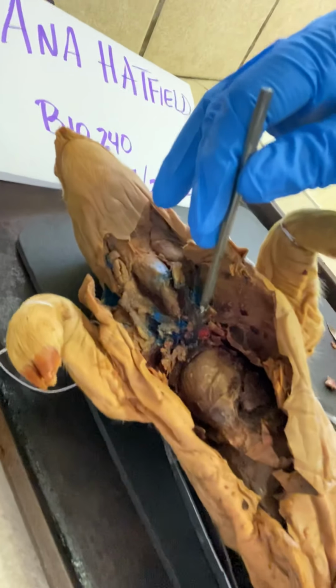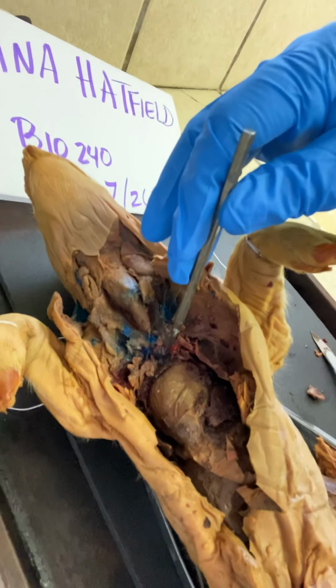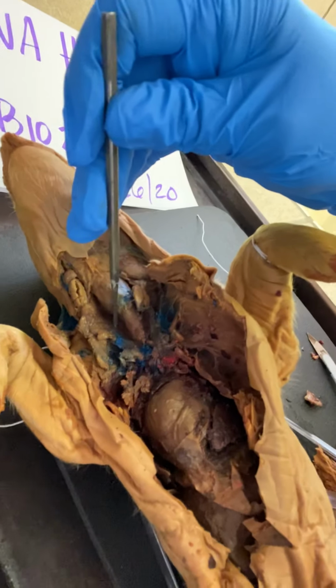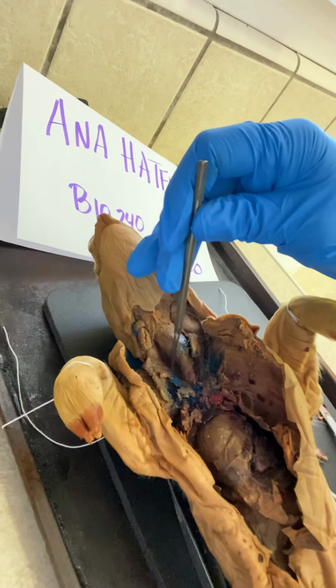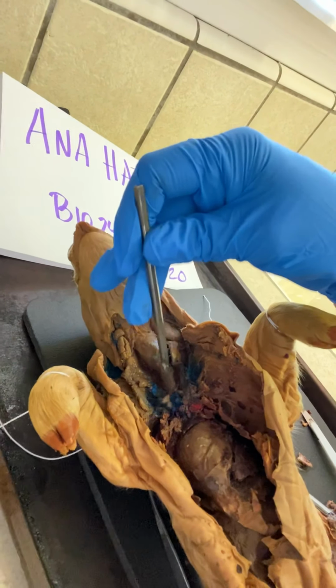And then you have the aorta that connects the main blood flow here to the heart. Then you have your right and left subclavian arteries, which are also next to the carotid artery, but they are closer to the heart over here.